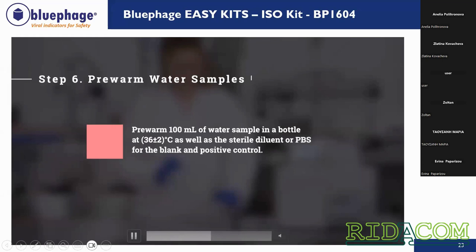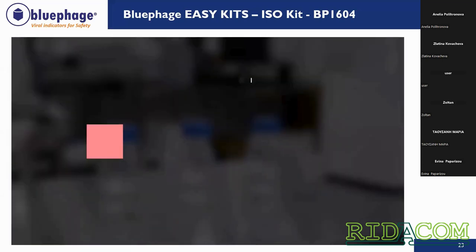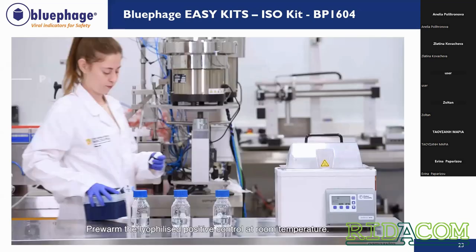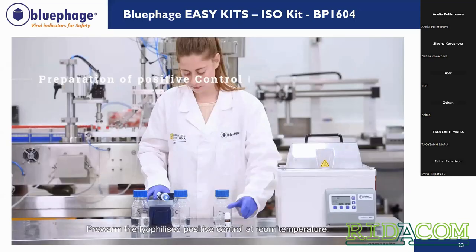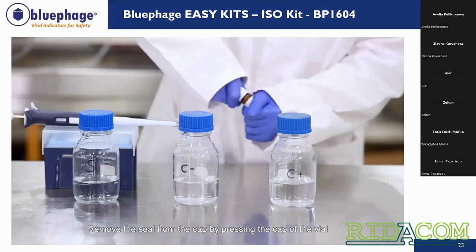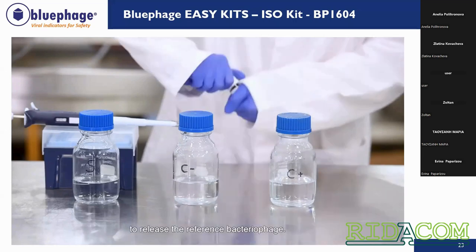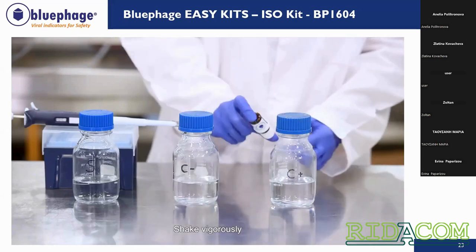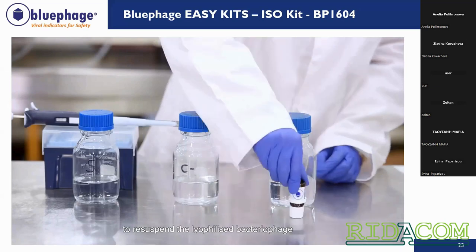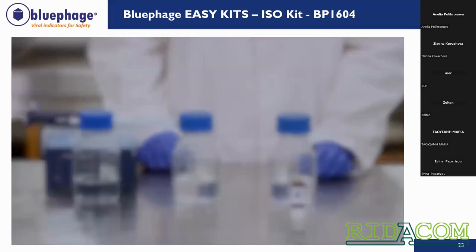So to pre-warm the water samples at 36 degrees, the best way to do it is to put them in a water bath, okay? Really important that they are pre-warmed properly. So now we will prepare the positive control in the same way that we have opened the E. coli vial. We will allow it to rehydrate for 10 minutes.